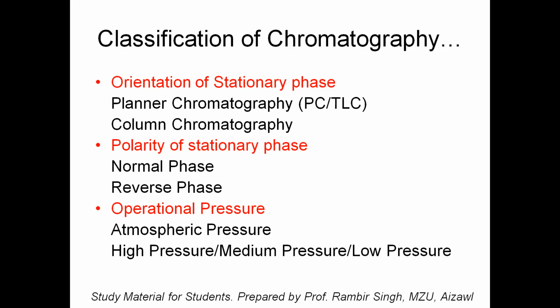Now, one advantage with silica is that it is not soluble in any of the solvents available, because silica is polar in nature. So what kind of solvent can dissolve it? Polar or non-polar? The polar one, very good.